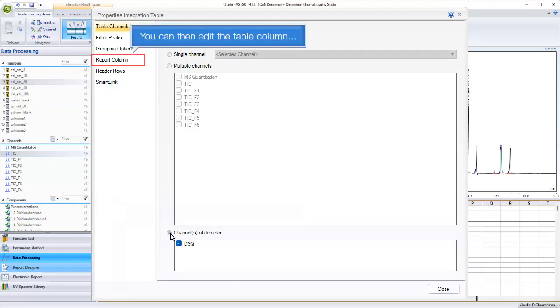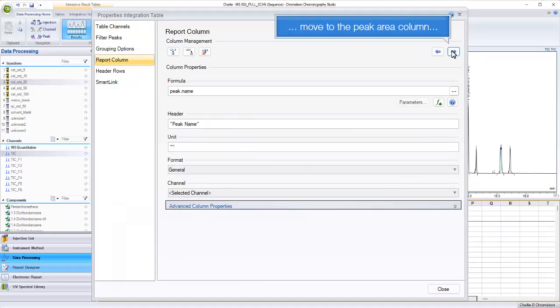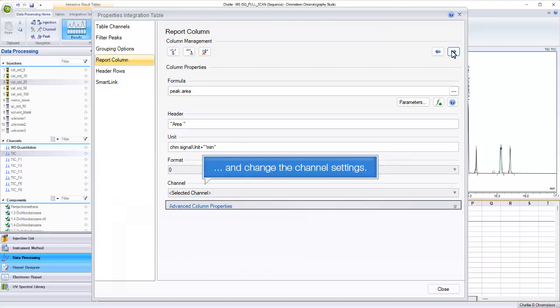You can then edit the table column, move to the peak area column, and change the channel settings.